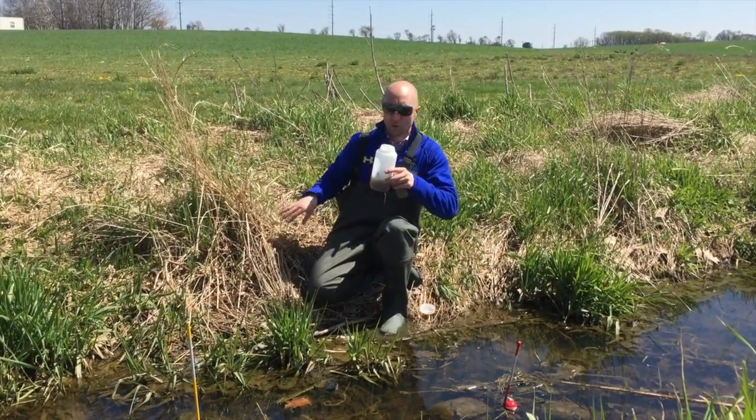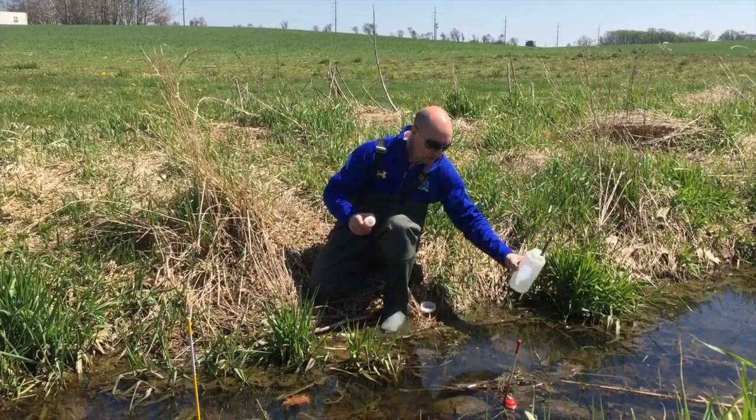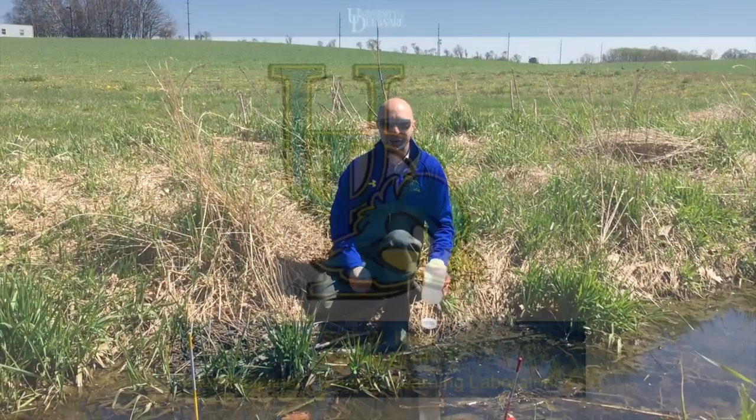Once again, when you're done with your composite bottle, you can dump it out and give it a very quick rinse. Have a good time.